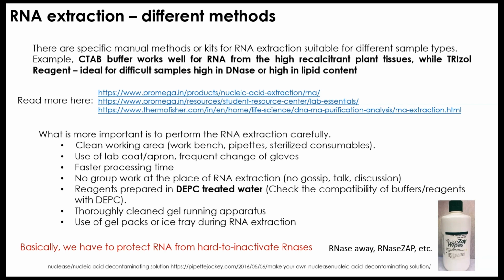When you are using gloves, don't touch your skin, because even in sweat or body fluids, you have a lot of ribonucleases which cleave the RNA, and then your RNA extraction becomes more difficult, right?